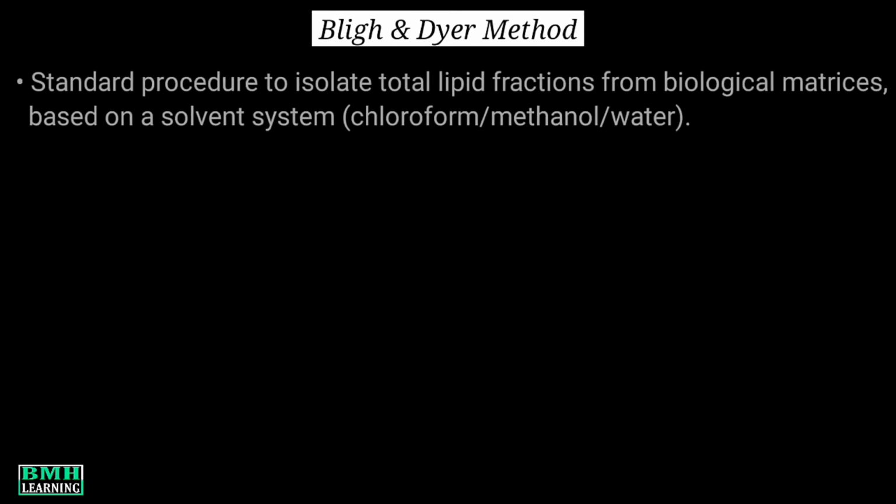In this video, we are going to talk about lipid extraction by Bligh and Dyer method. Lipid extraction by Bligh and Dyer method is one of the standard procedures to isolate total lipid fractions from biological matrices based on a solvent system consisting of chloroform, methanol, water.